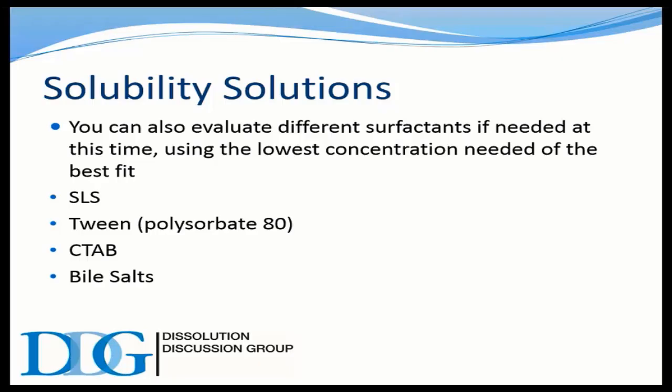I think the important thing to consider when you're looking at the minimum volume is what the accuracy of your analytical balance is. As long as you've got confidence there that your volume and your weight are going to be accurate enough to do the test, then by all means you can go lower.